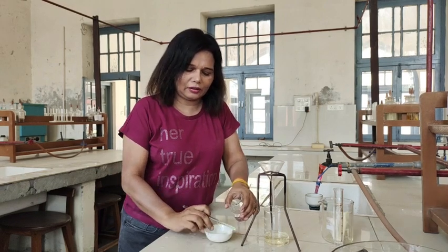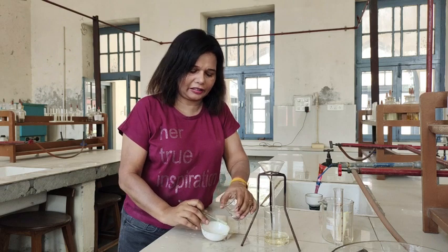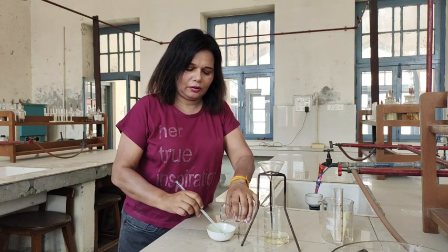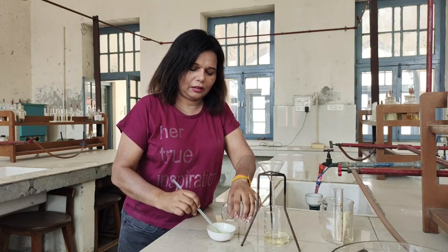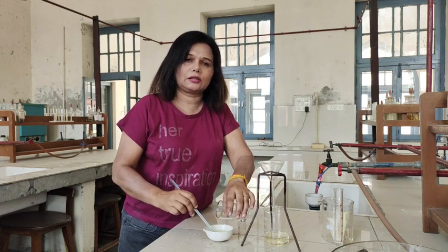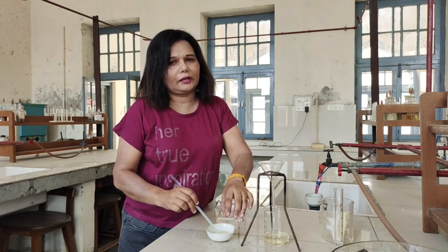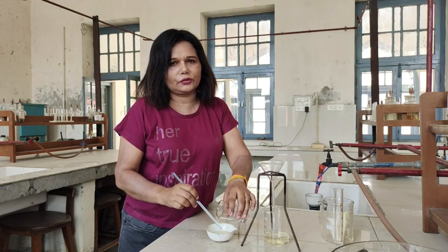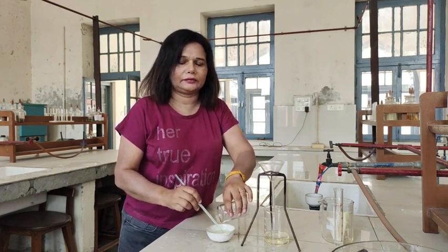Now we'll dissolve this crude mass of iodoform in rectified spirit completely, so that it completely dissolves in the rectified spirit. Now let's move towards the other apparatus, that is, the round bottom flask fitted with the water condenser, so as to heat it and recrystallize it.